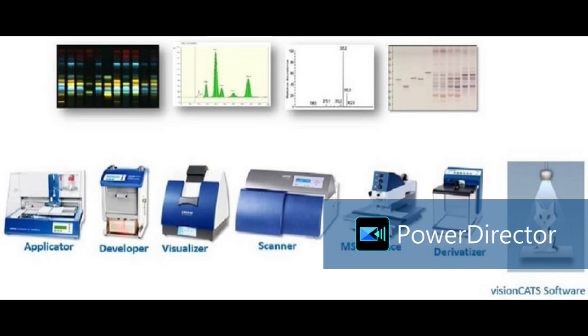So these two modules we are using for sample application. This is the semi-automatic Linomat 5 with spray-on technique, and this is completely automatic. Here syringe rinsing and filling is manual. Otherwise it is also connected to software. We can program the application volume, band length, etc. in the software.